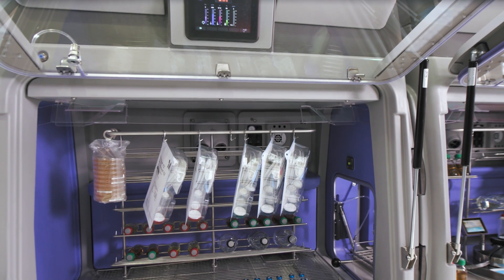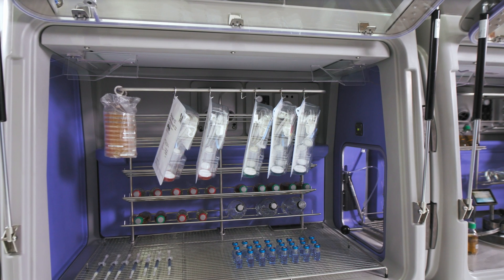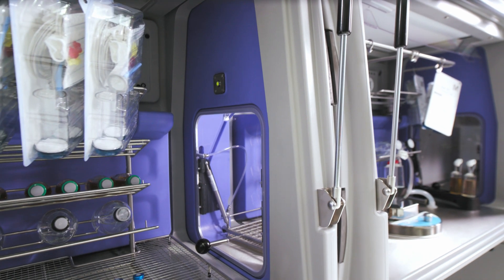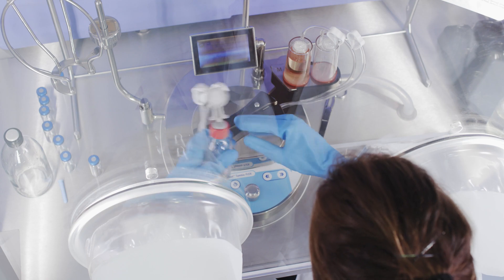Consistently crafted, ergonomically designed and avoids the risks of leaks associated with welds, joints and gaskets found in other isolators. And with initial cycles for testing being standardized, validation is rapid. This means that you can have a fully implemented and validated system in as little as 12 weeks from the initial order.